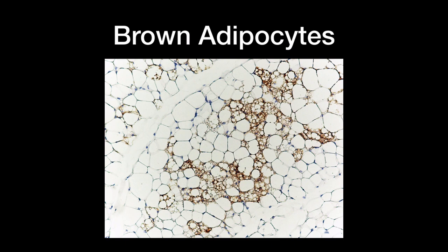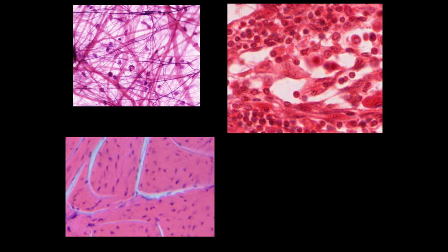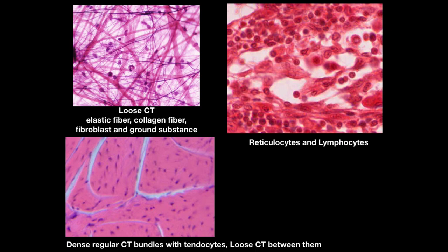That covers all the structures in connective tissue. As a challenge, three pictures of different types of connective tissue are shown — can you identify all the cells? The answer: the first shows loose connective tissue with thin elastic fibers running in all directions and thick collagen fibers with fibroblasts between them, and ground substance in the background. The second shows dense regular connective tissue bundles in a tendon with tendocytes, and loose connective tissue with fibroblasts between bundles. The third shows reticulocytes and lymphocytes in lymphatic tissue.